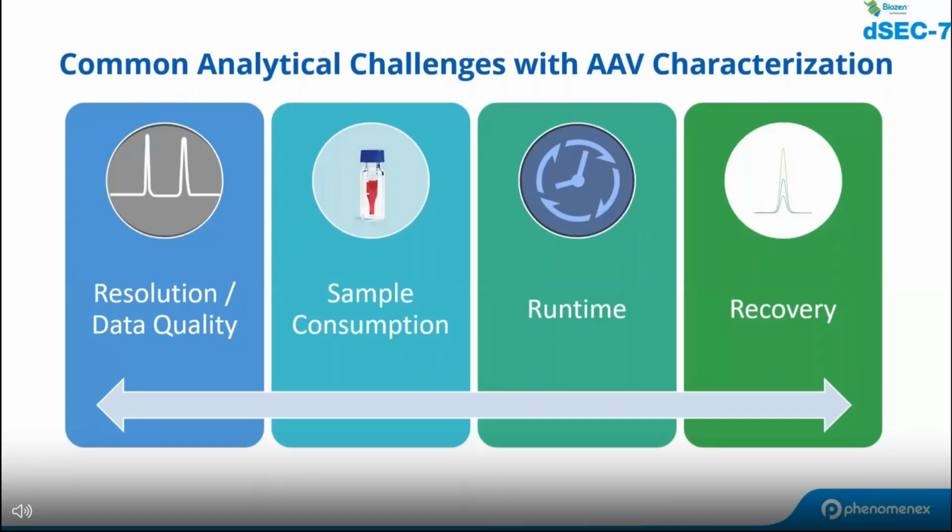And when we talk to these customers, sample consumption is a big deal for them. The samples are very scarcely available. So if an analytical technique could save sample by utilizing the least amount of sample for the analysis, the remaining sample can be utilized for other testing purposes. So it's important to keep those in mind when talking about these analyses.